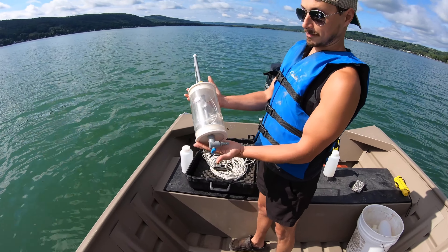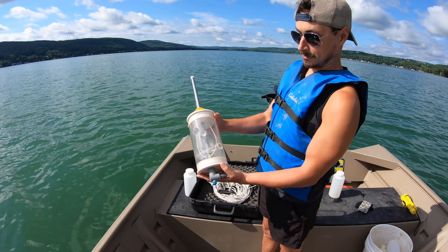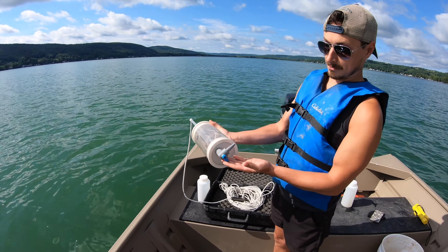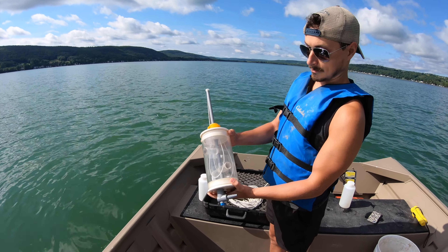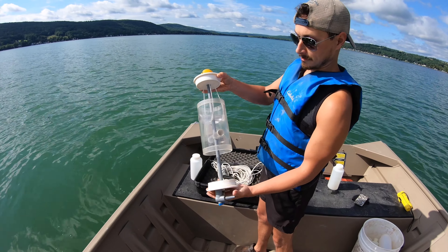Matt has a Kemmerer bottle. This takes samples at the bottom. You send it down, you open it up, and it will close. There's a spout on the bottom that opens when you have water in it, and you can close it when you're going to the bottom of the lake. It clicks open to pull both sides like that.